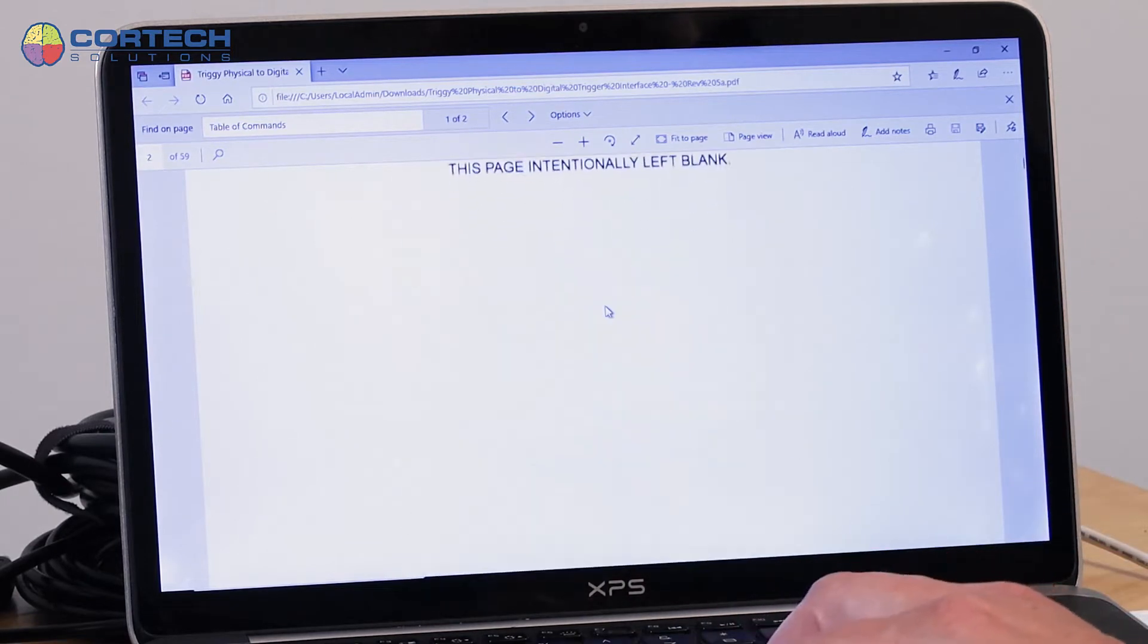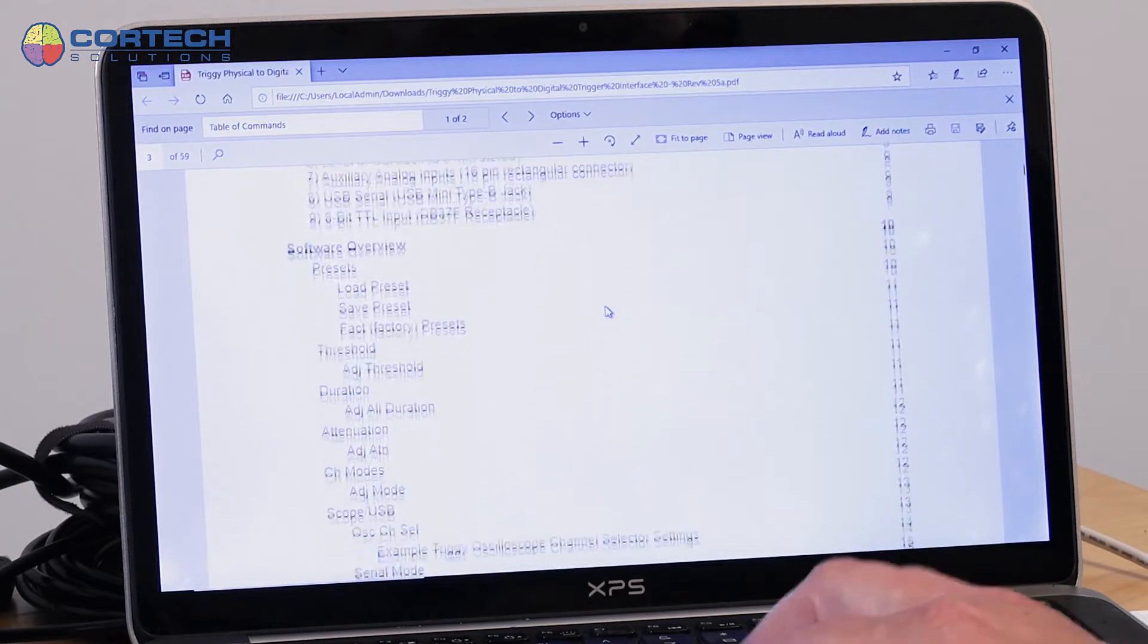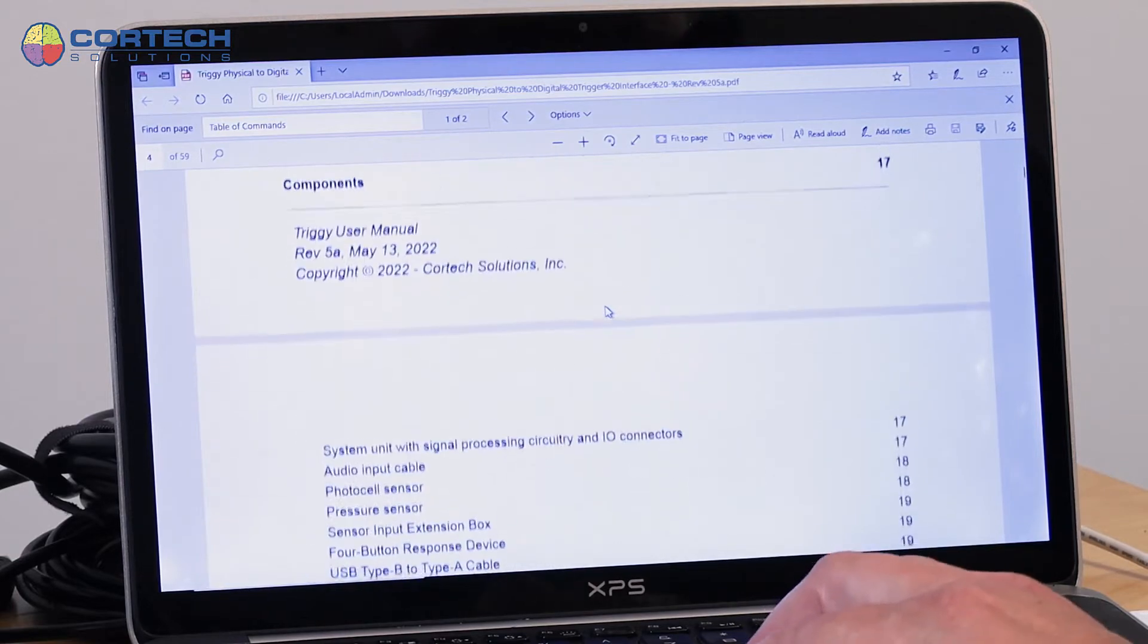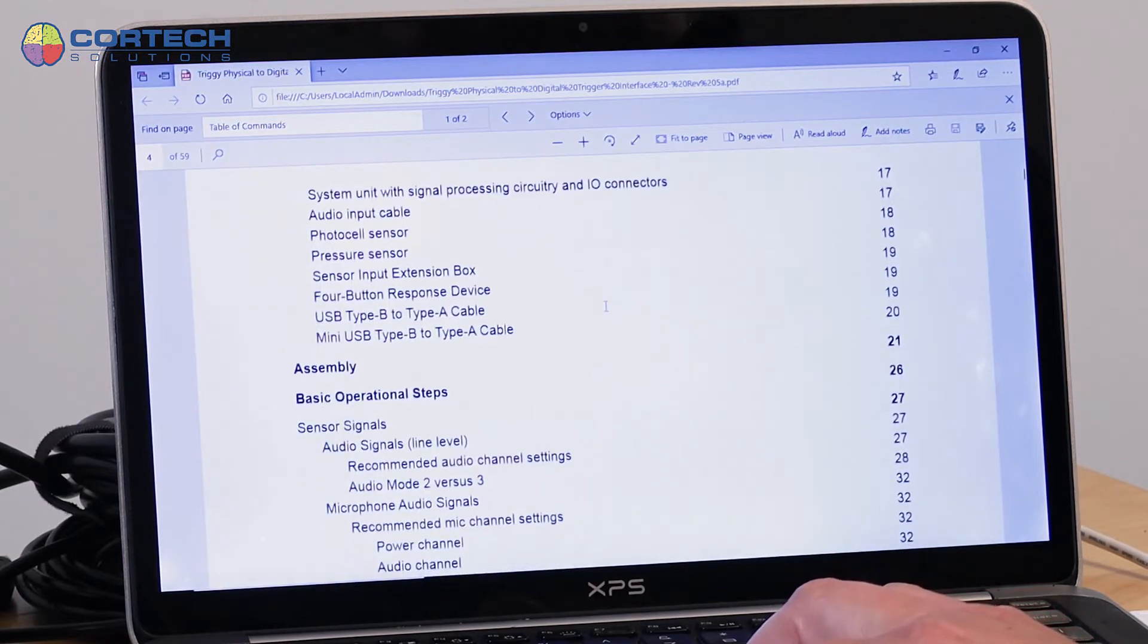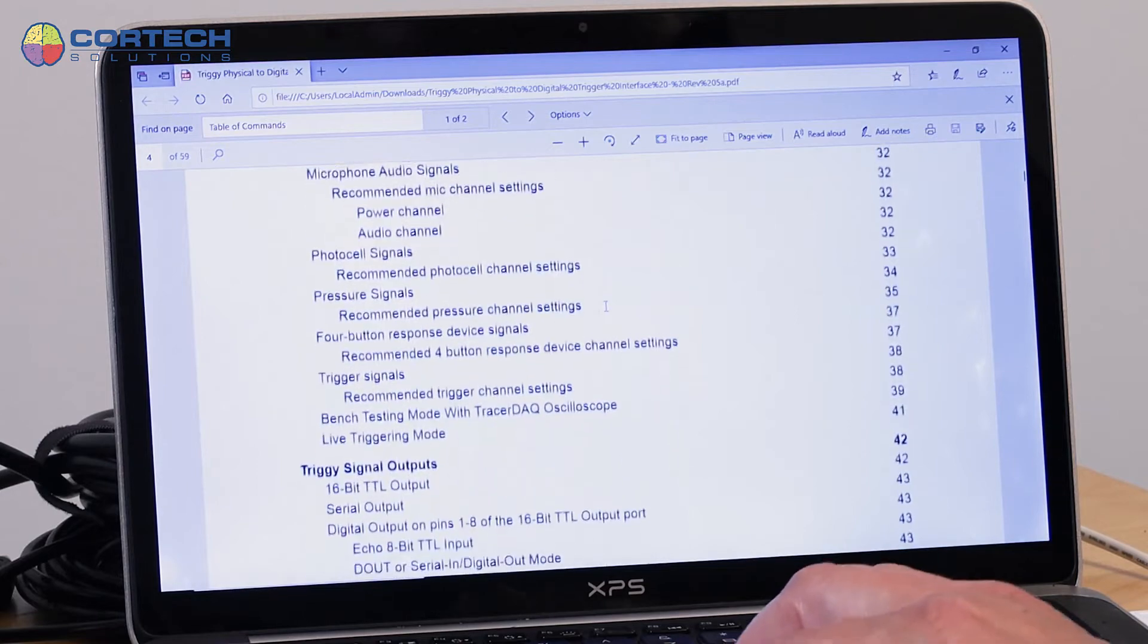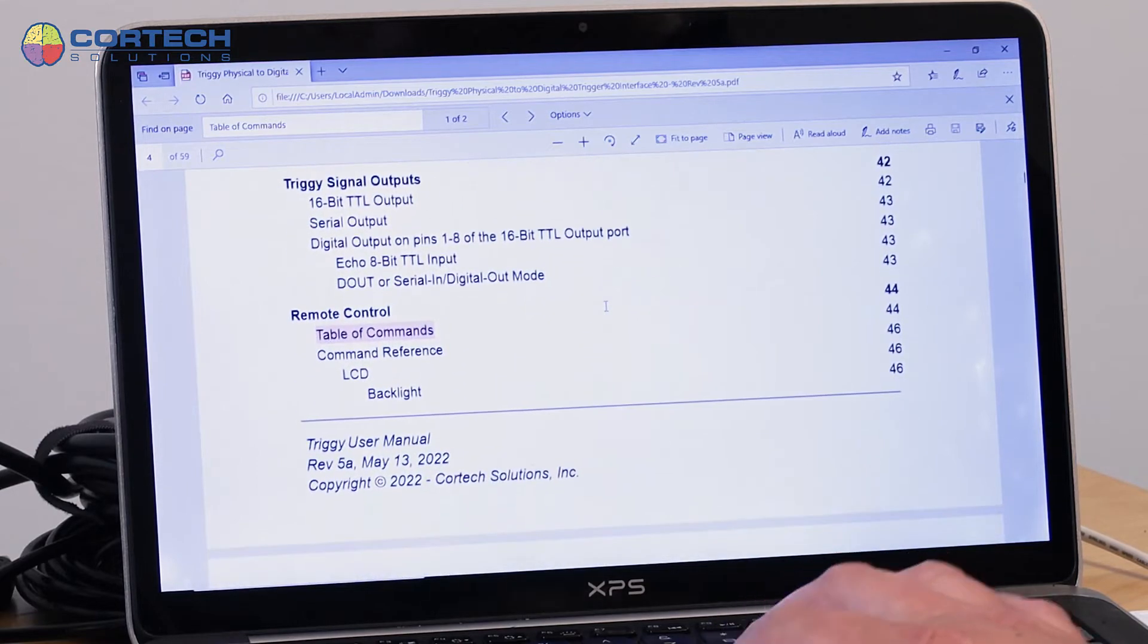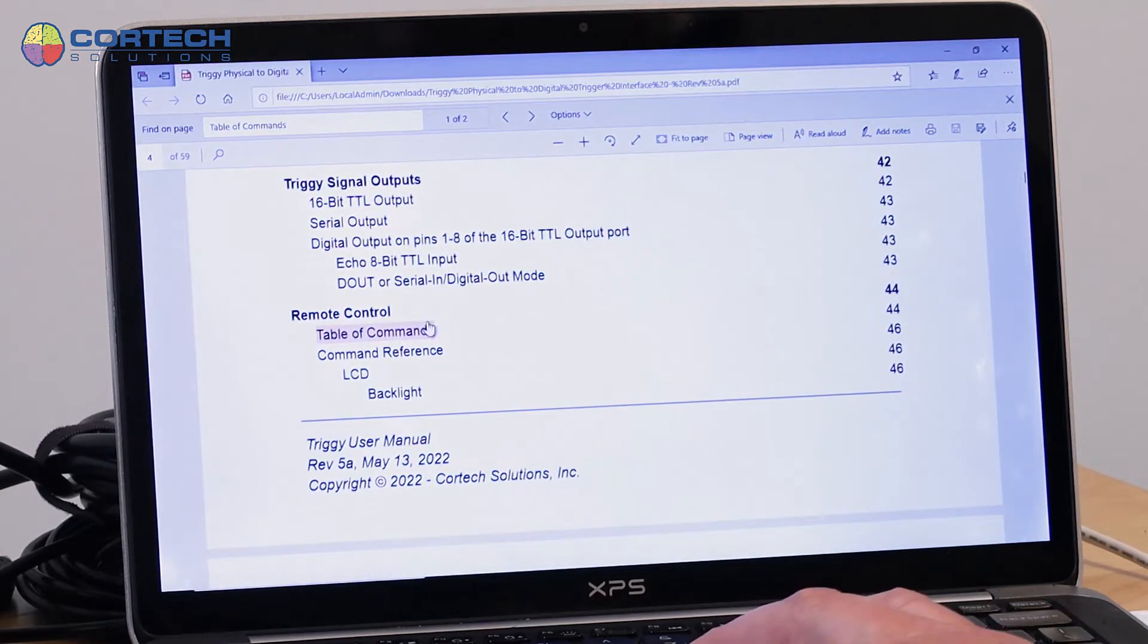So in the Triggy user manual, if you go to the table of contents, one of the last entries here in the table of contents is this table of commands and the command reference.